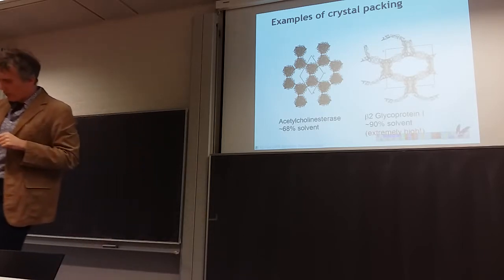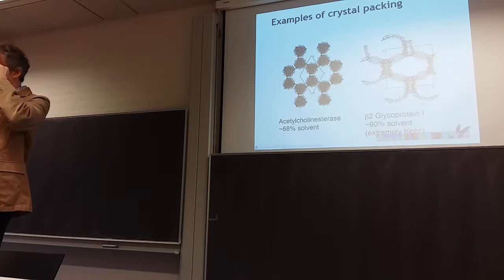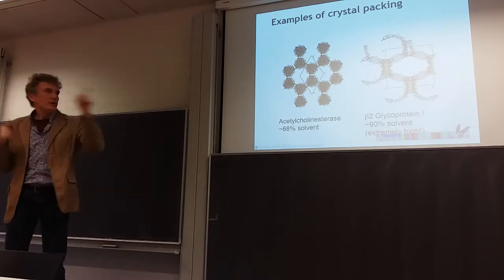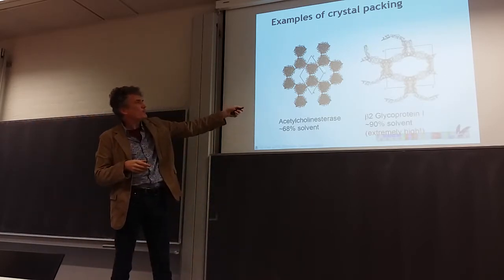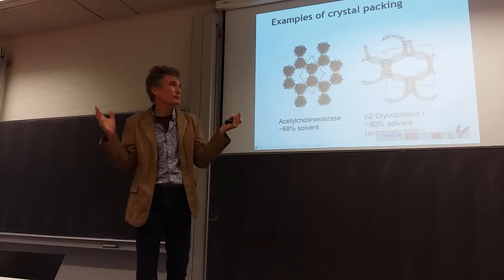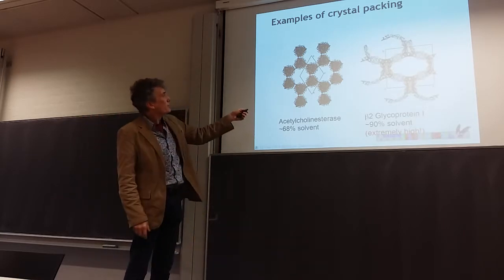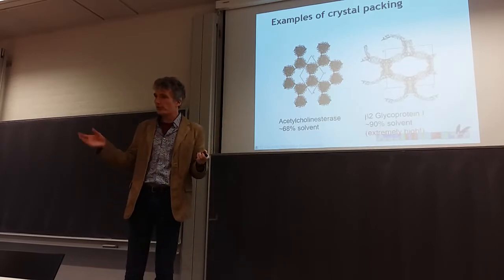I have to explain it going back from what you said. First, this is just how the crystal is built up. Because if it's not a repetitive unit, it's not a crystal. We'll come back to how you actually collect the data from the crystal.